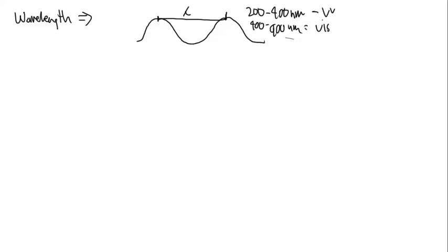So what range are we working with in infrared? That's the question that we're going to have to answer in the very beginning before we go any further with the machine. Now, the same definitions are also going to creep up as far as frequency goes.